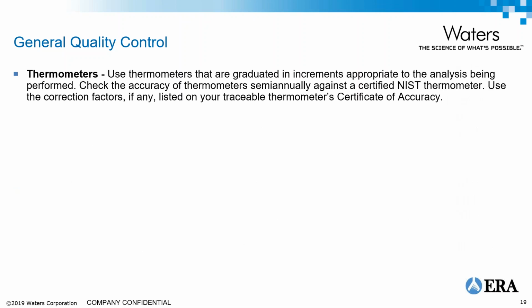Thermometers. You need to make sure that they are graduated in the appropriate increment for the analysis being performed. You need to make sure that they've been checked against certified NIST thermometers. That gives you any kind of correction factor. You want to make sure that you're using them.